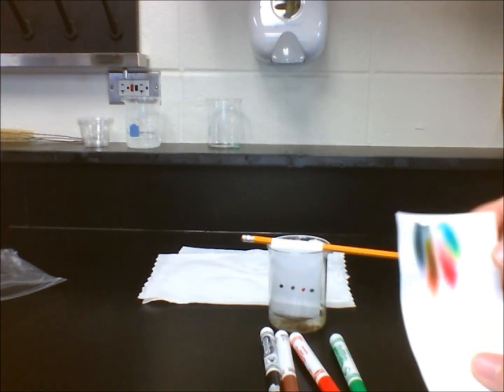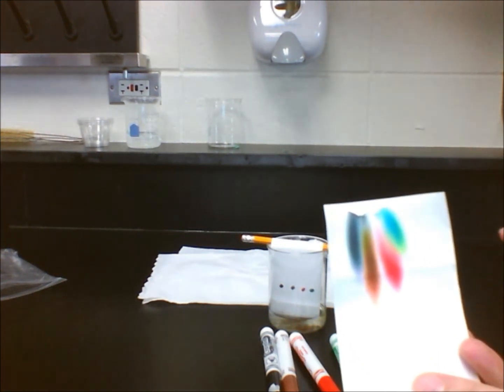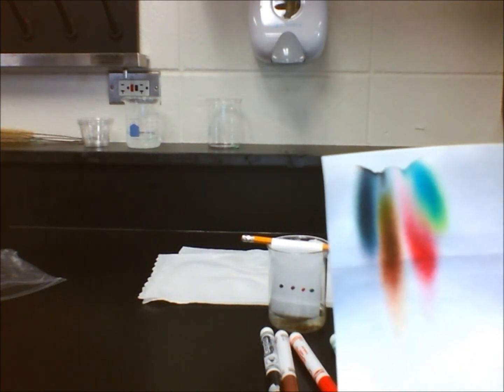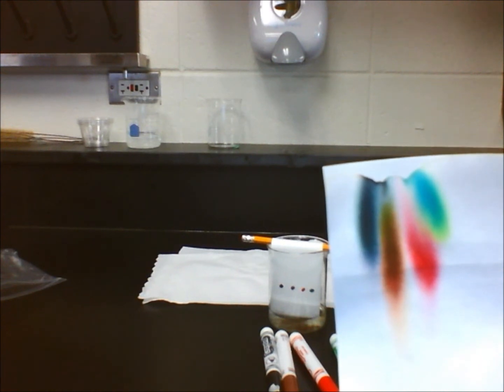The brown ink is composed of several different solutes. You can see purple, yellow, and red being separated on the chromatogram. Like in lab 17.1, you can also see that the green ink is composed of a yellow solute and blue solute.